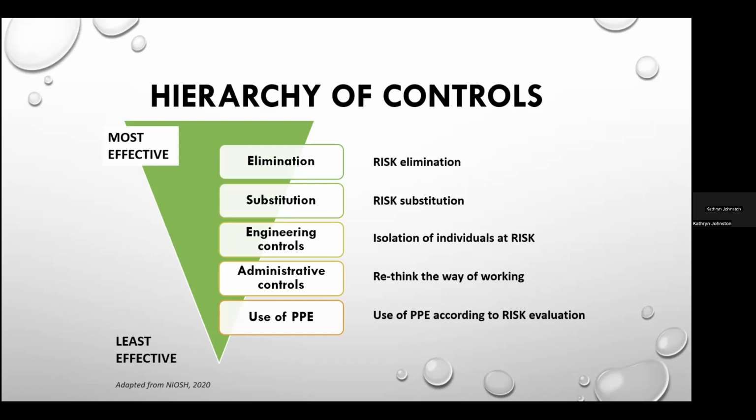And while administrative controls and PPE programs may be relatively inexpensive to establish, the problem is that they require significantly more effort by or rely on the affected or exposed workers. So they tend to be more costly to sustain and much less effective.